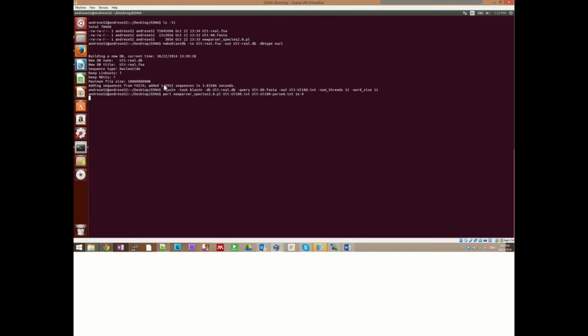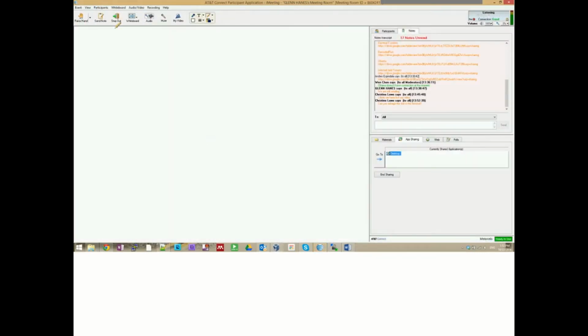Andres, is there a way you can enlarge the text in your Ubuntu? Large text. Excuse me a minute. If you go to the View option in your menu, let me try it.